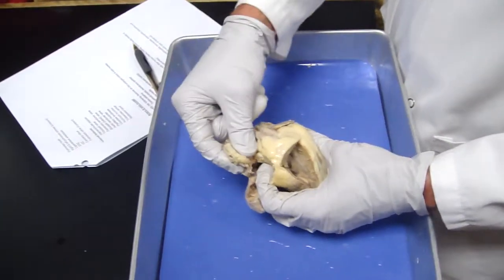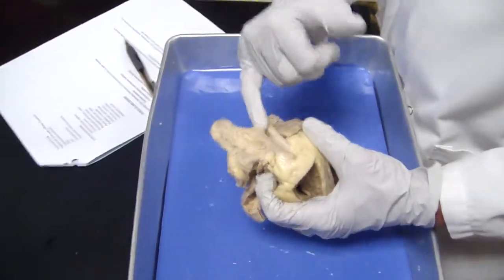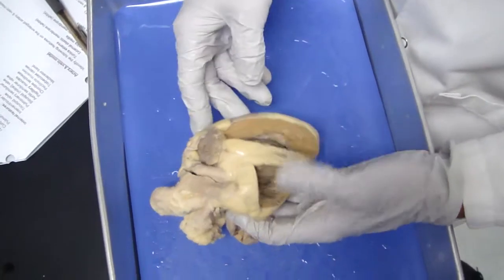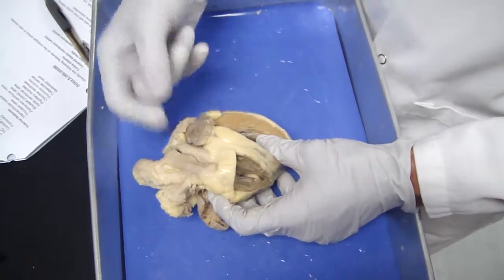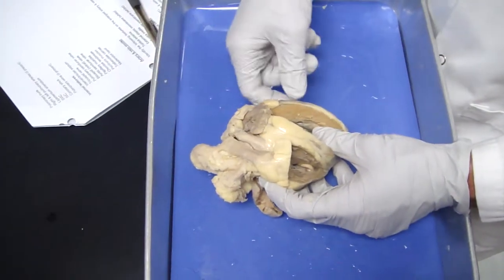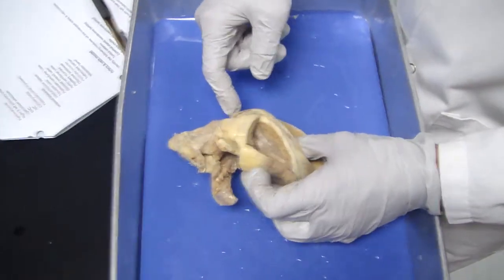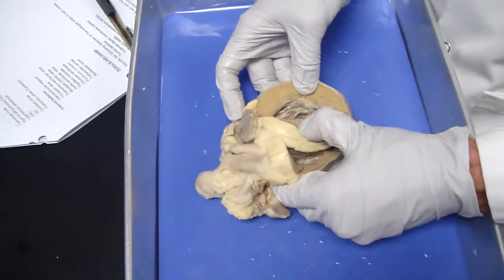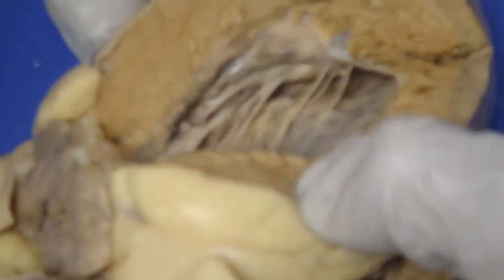Then you should be able to figure out that's brachiocephalic trunk. This, which I split open, is pulmonary trunk, which based on shape, color, size, location, if I put a rod in there, you should know that that's pulmonary trunk. Right auricle, which we cut open. Papillary muscle, chordae tendineae, trabeculae carneae.